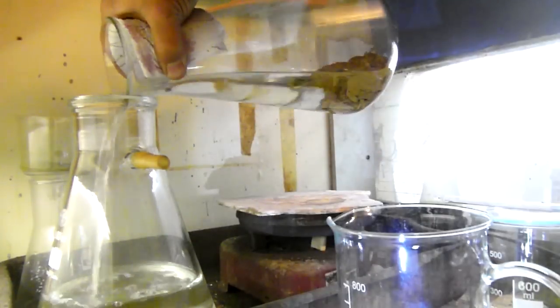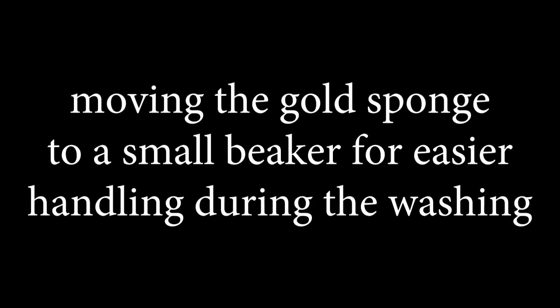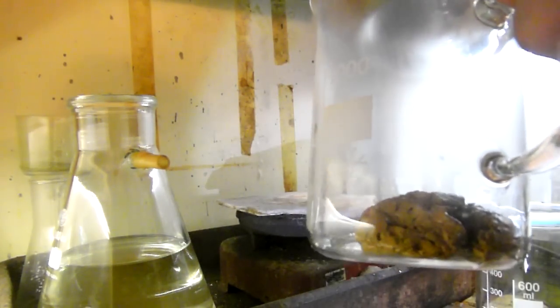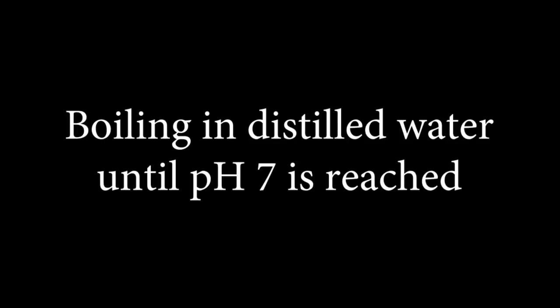Decanting. Moving the gold sponge to a small beaker for easier handling during the washing. Boiling in distilled water until pH 7 is reached.